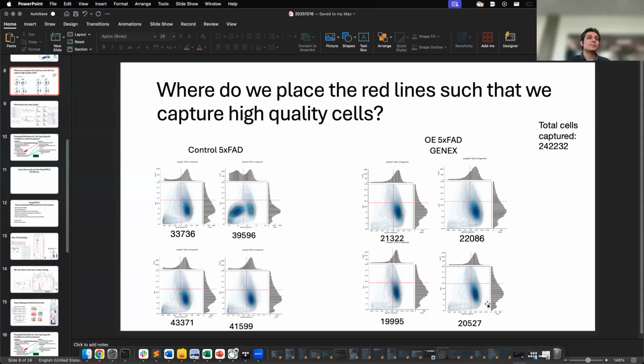But even knowing what fragment size we're choosing to go with, I think that's a hard one. Right? Yes, this depends on your tissue or the question that you're trying to study. Right now, just by eye and just on vibes, I've basically been taking where there starts to be a kind of curve in the second peak in that top distribution, and that will tend to line up with the lower end of the nuclear fragments to take.